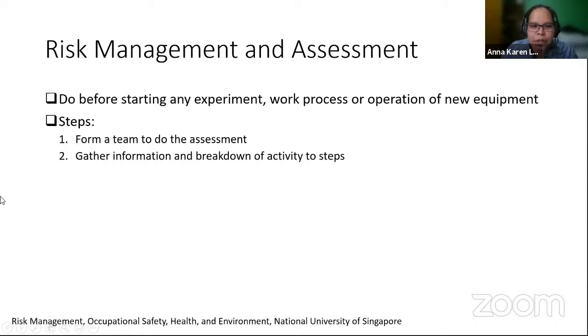Okay, so the steps: first, form a team to do the assessment, gather the information, and break down the activity into steps. Important here is the breakdown of the activity into steps. It really has to be step by step. If you are looking at a particular protocol, your risk assessment has to break down the different steps of your protocol. You can't treat it as one bulk, steps 1, 2, 3, and call that the risk assessment. It has to be step by step.